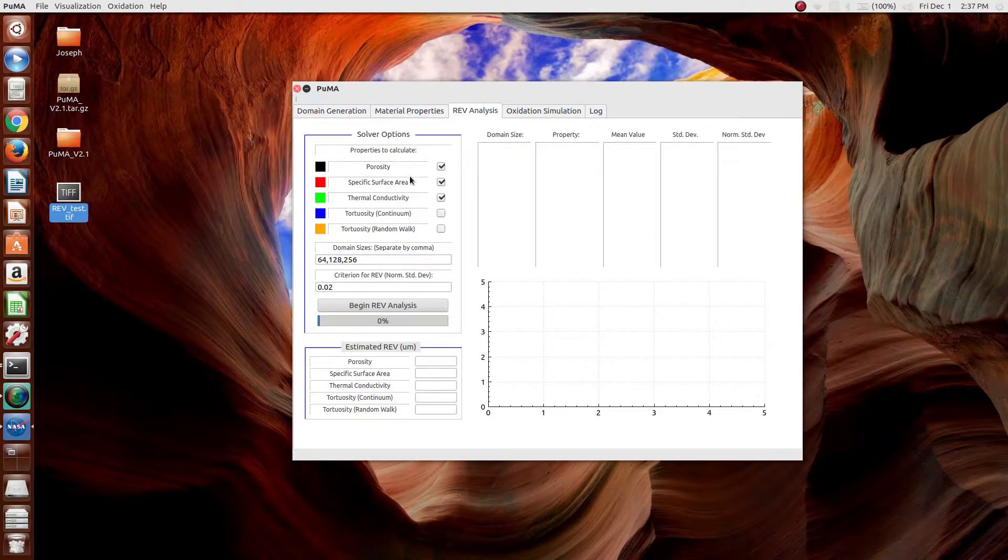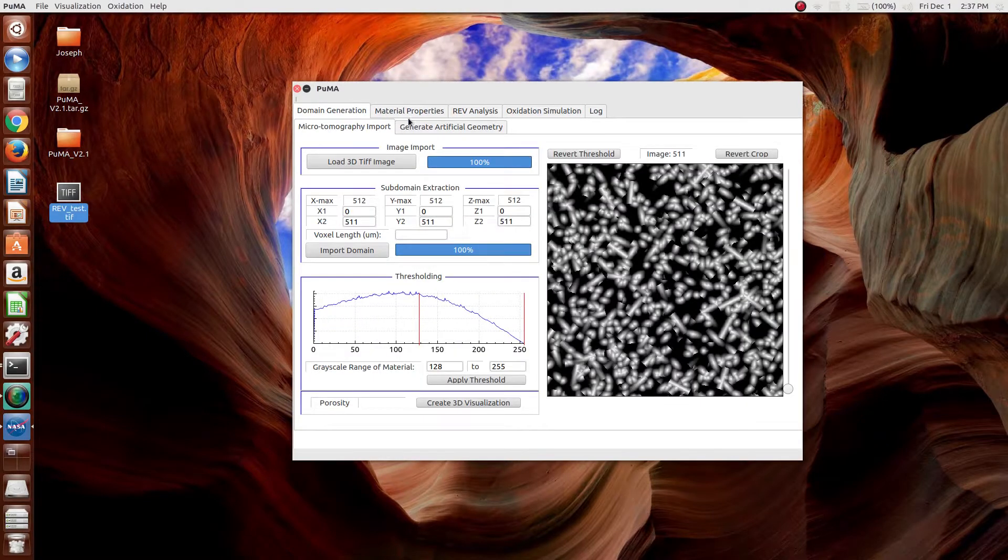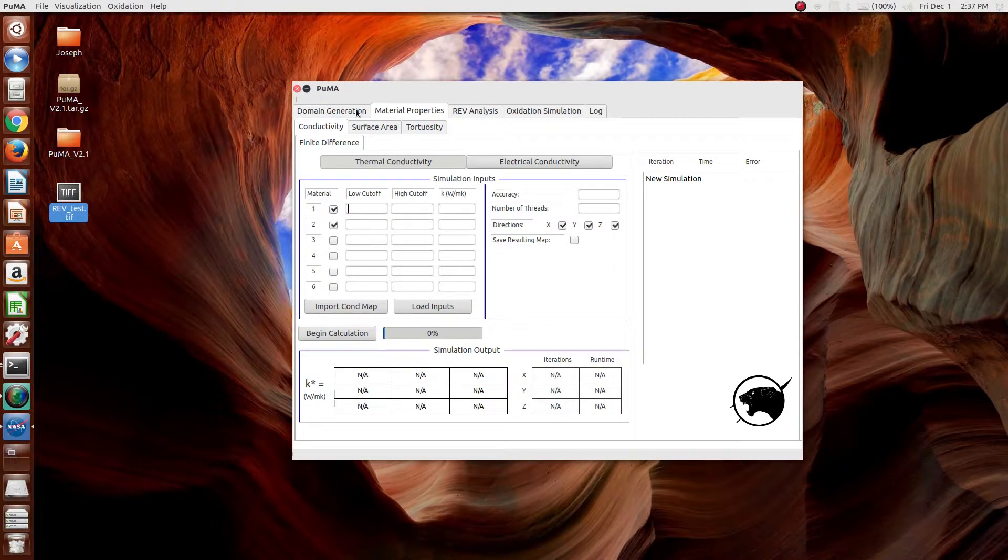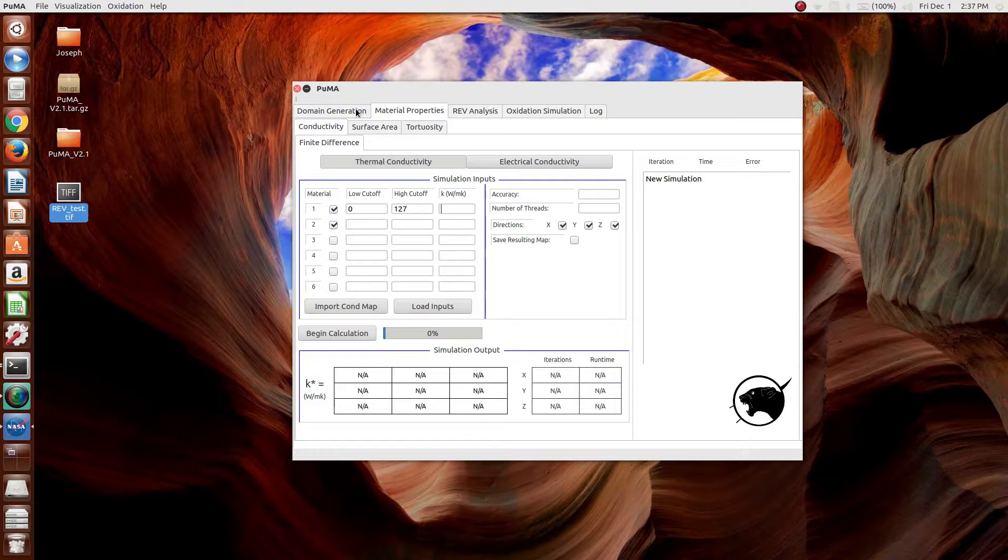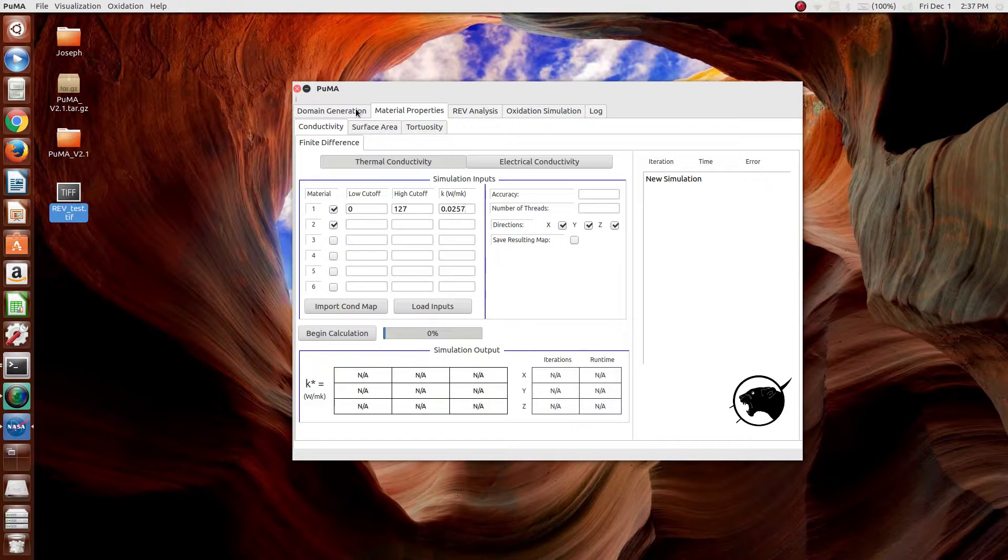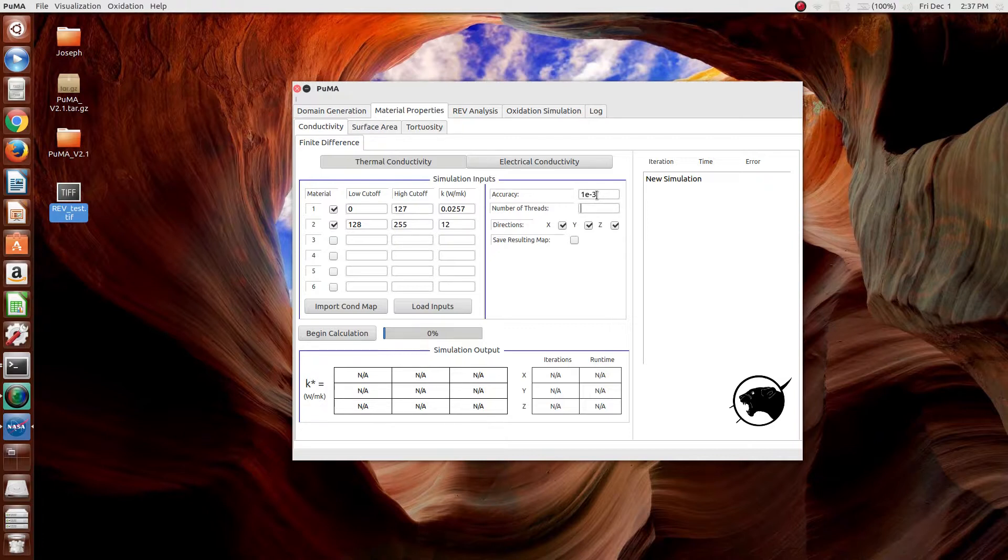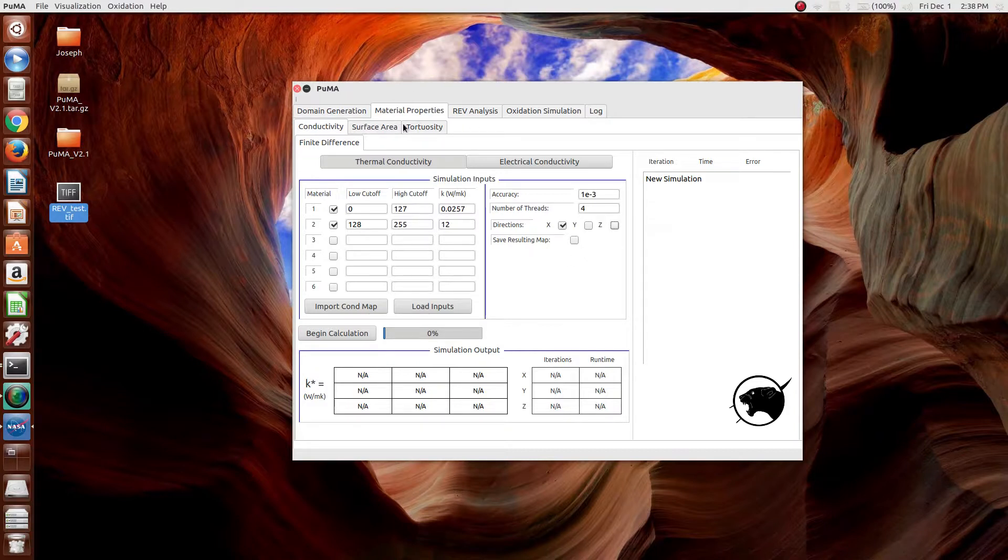For the thermal conductivity, we have to input the appropriate input values. In this case, we want to specify the void phase with a local thermal conductivity of 0.0257, which is the conductivity of air, and then 128 to 255 with a thermal conductivity value of 12, which is the thermal conductivity of a carbon fiber, approximately. And then an accuracy. We'll take 1e to the minus 3 to make it a little bit faster. The number of threads, we'll select 4. And we'll only specify it in one direction.